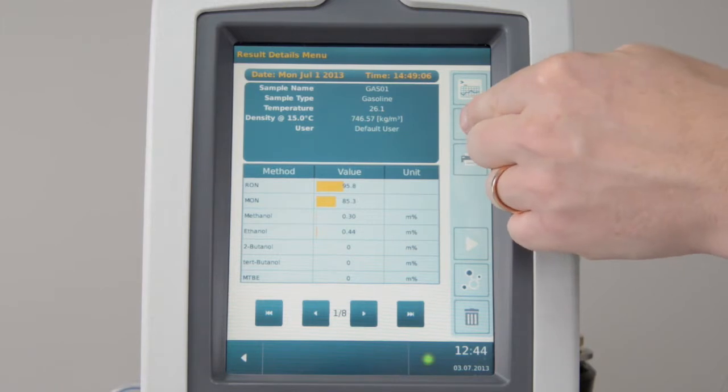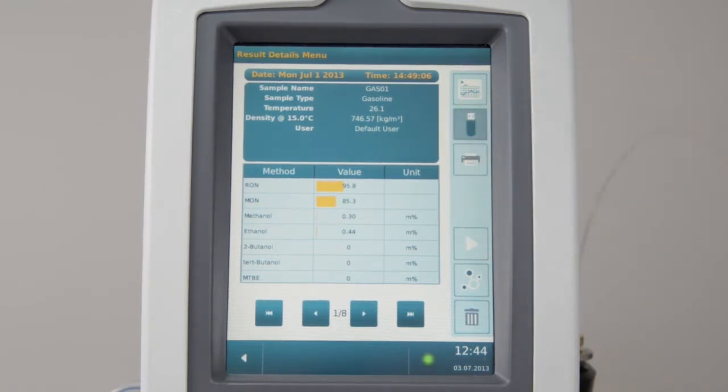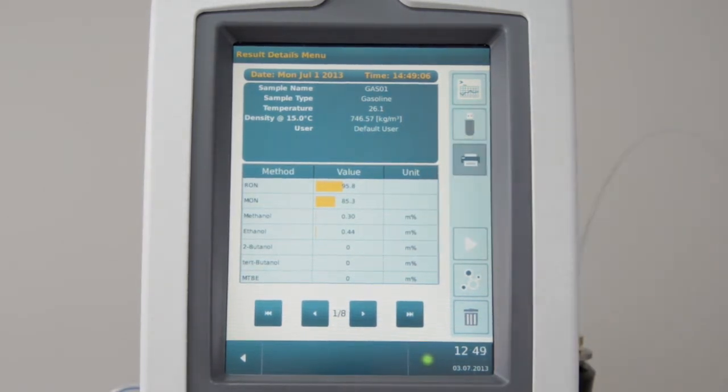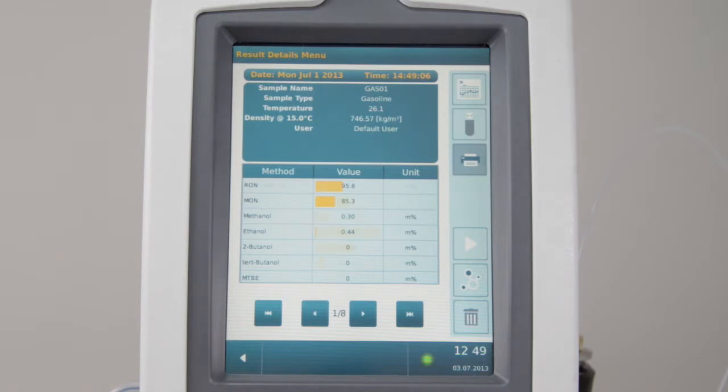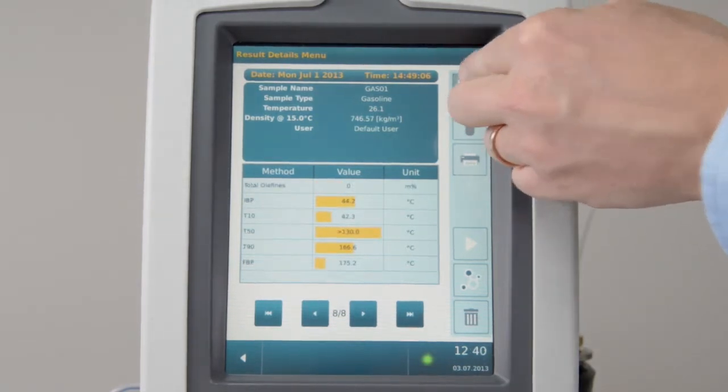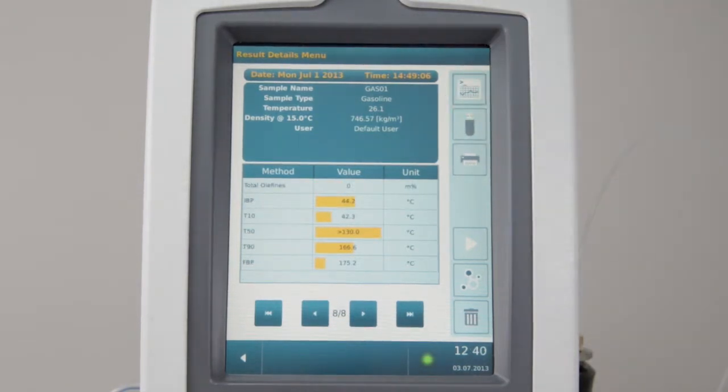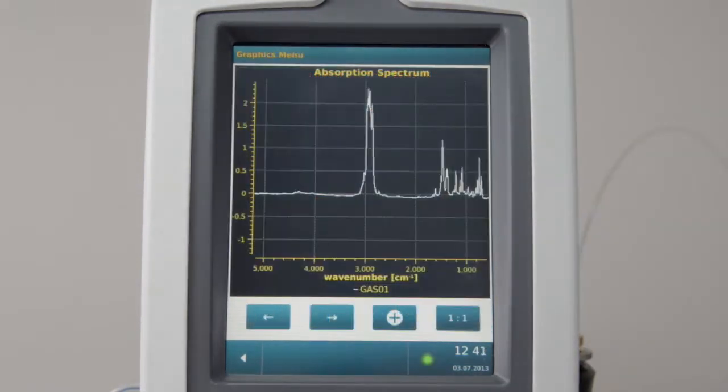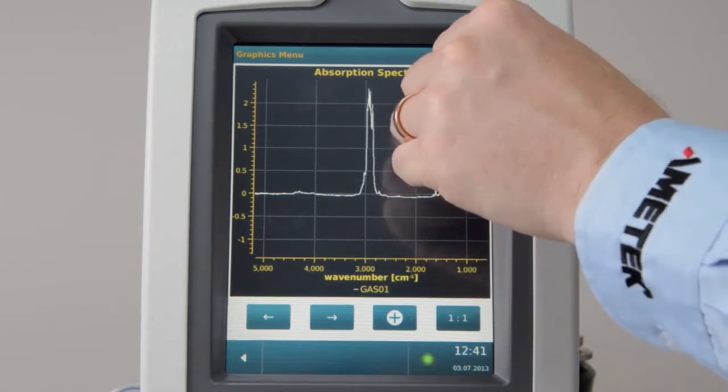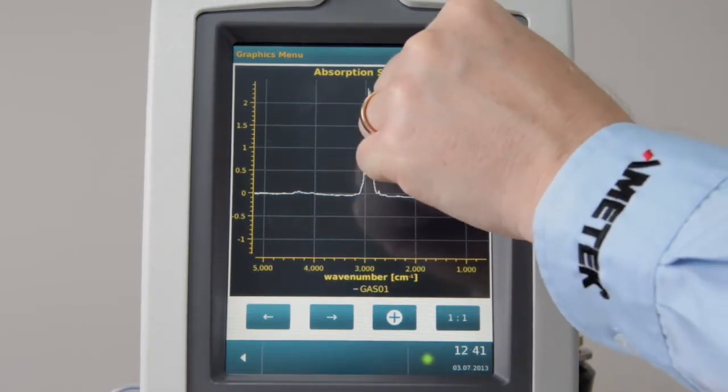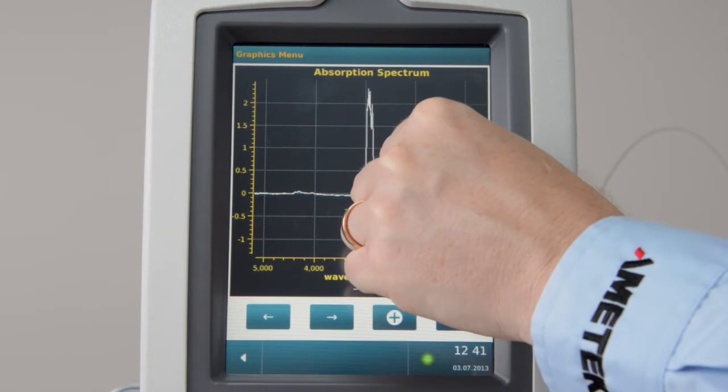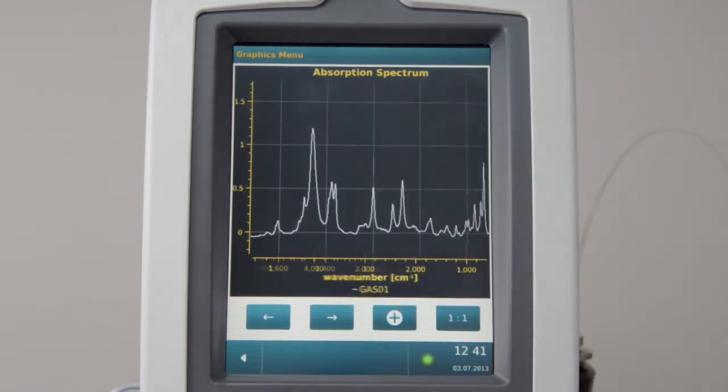Results can be downloaded to USB and printed. Choose the top right button for reviewing results spectra. Zoom in on the spectrum and use the left right buttons to navigate.